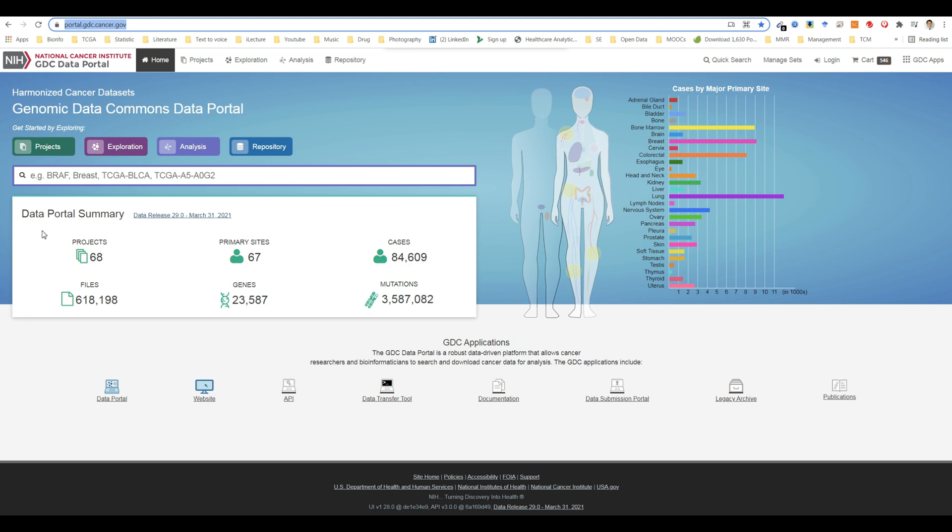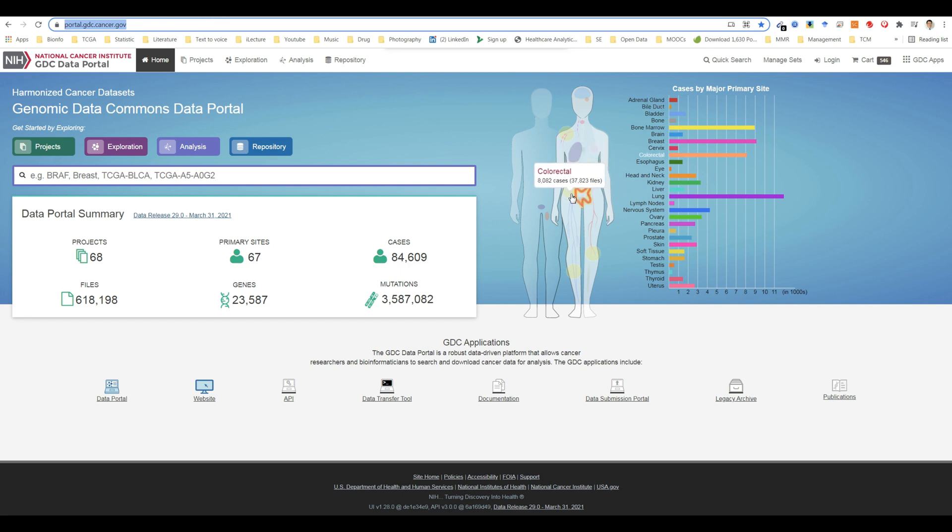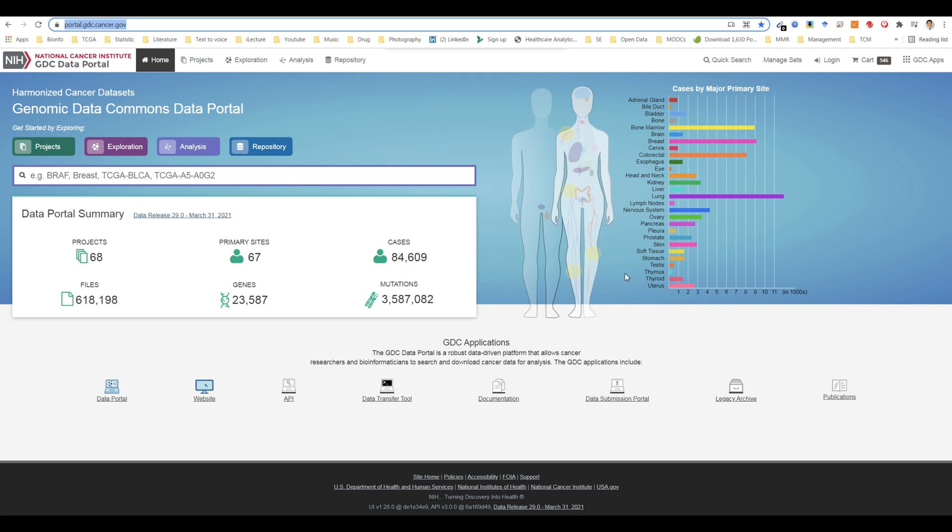These include navigation based on project, exploration, analysis, repository, or human anatomical sites. Each view provides a distinct representation of the same underlying set of GDC data and metadata.